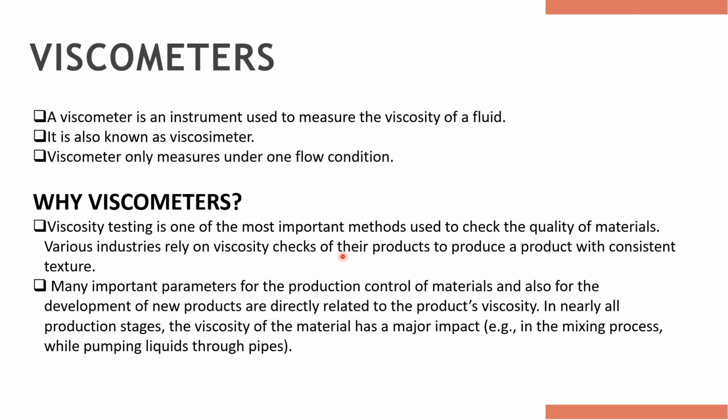So what are viscometers? In general, a viscometer is an instrument that is used to measure the viscosity of the fluid. It is also known as viscosimeter. A viscometer only measures under one flow condition. So here one flow condition represents that viscometers measure the constant viscosity of a fluid, like the fluid or the sample which you are measuring, the flow condition should be constant. Only in that case viscometers are used. Otherwise, you can use another instrument called rheometer where the flow conditions keep on changing.